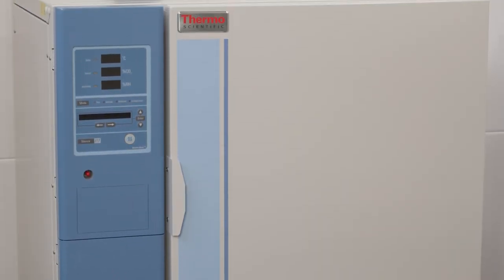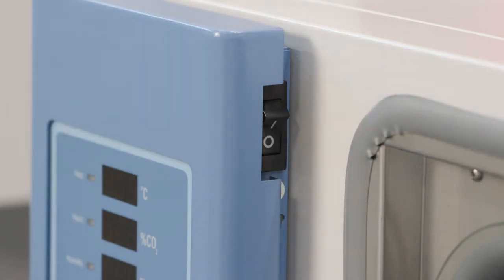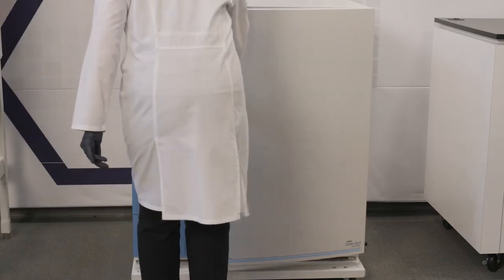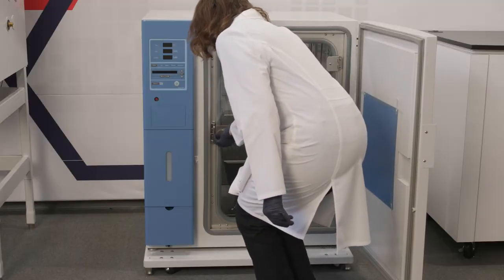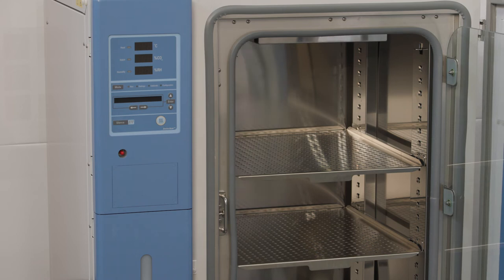Before beginning, move all cultures to a different CO2 incubator. It is best to switch off the CO2 incubator power during cleaning. Stericult CO2 incubators are designed with shelves and supports that are easily removable without tools, and the CTS series features an electropolished stainless steel interior which reduces microscopic structures to minimize areas where microorganisms could hide.